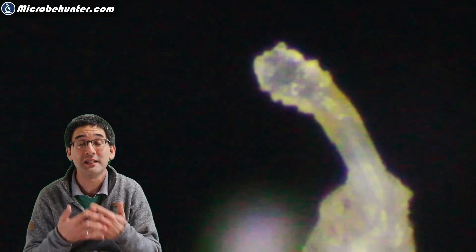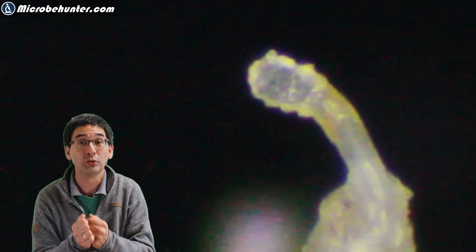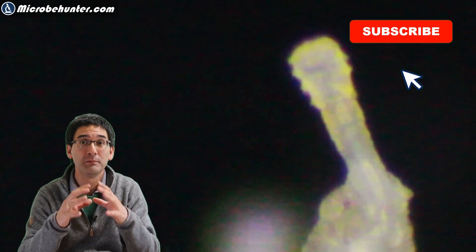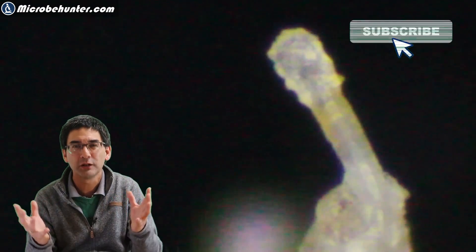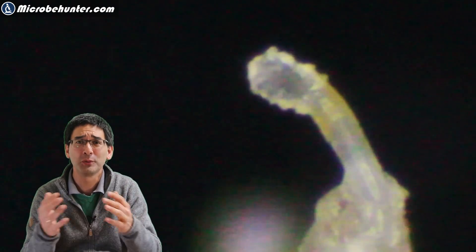Because it was so painful I tried a different method. I now glued the slide next to my nose and also tried to pull it off, hopefully bringing along some of those Demodex mites — unfortunately not very successful, so I have to show you again the same one from before. There are actually easier ways. The super glue might have also killed some of those mites — they're covered in glue and therefore difficult to see under the microscope.